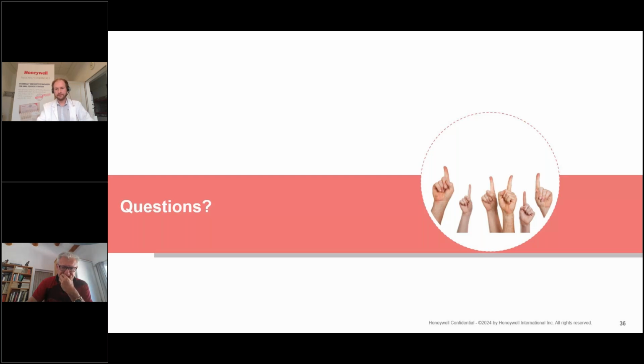Yeah. Thank you, Roman. I've seen many questions, and we will bring the answers later. But the last one could be: is Hydranal Coulomat AFA and CFA free of imidazole?